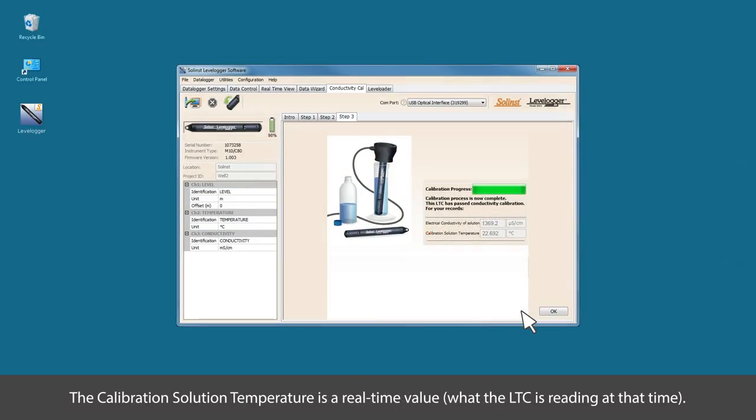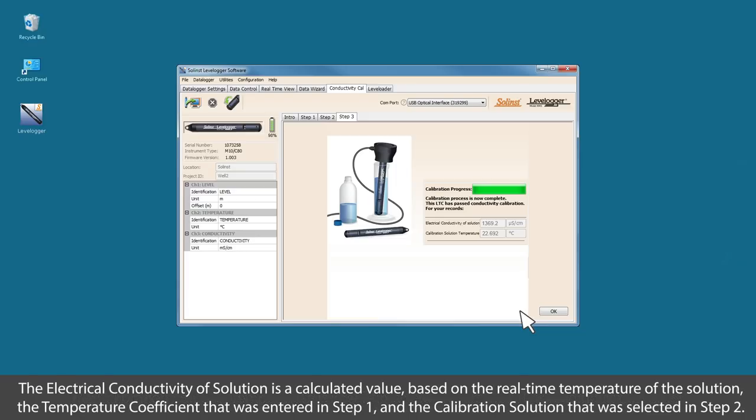While the logger calibrates, two values will be shown on the screen. The calibration solution temperature is a real-time value, what the logger is reading at that moment in time. The electrical conductivity of solution is a calculated value based on the real-time temperature of the solution, the temperature coefficient that was entered in step number one, and the calibration solution that was selected in step number two.